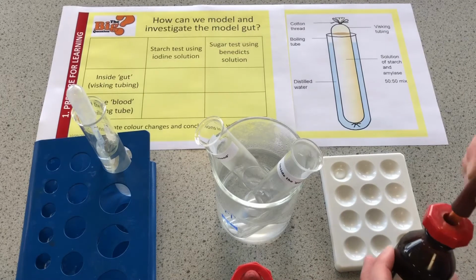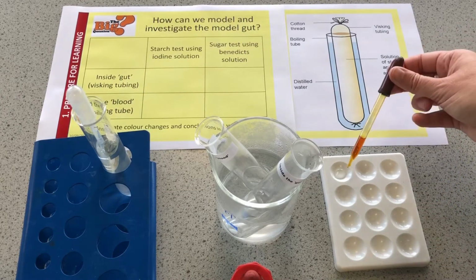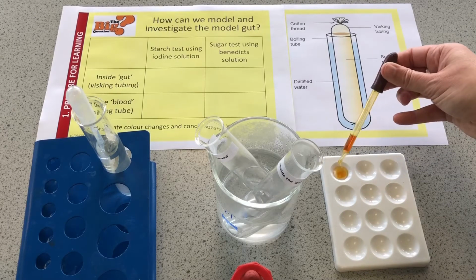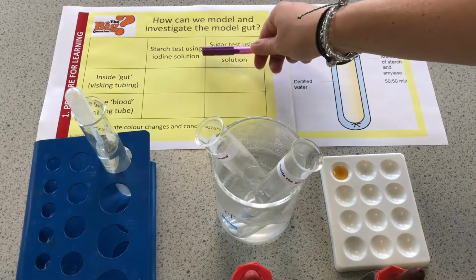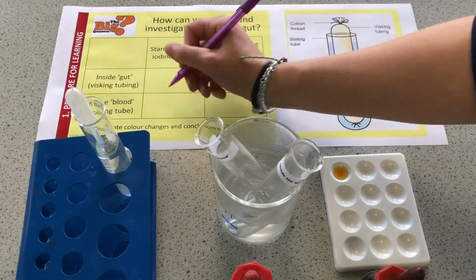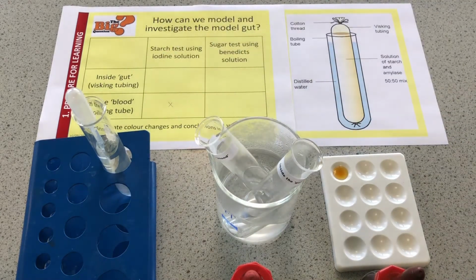Now, the iodine starts off orange, and if it goes blue-black, then there is a presence of starch. I've got no colour change there at all, so that means I'm able to say starch test using iodine solution in the blood is a negative test. There's no starch present in the blood, which is exactly what we expect, because starch is too large a molecule to get through the wall of the small intestine and into the blood. That's why we need to digest it using that amylase.